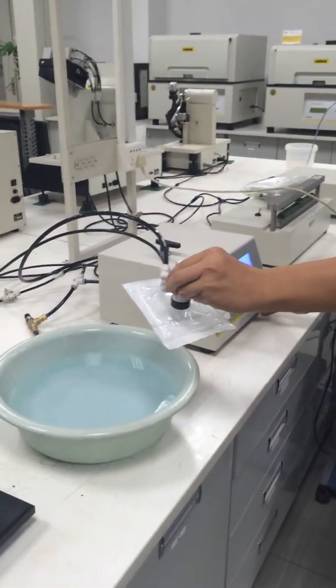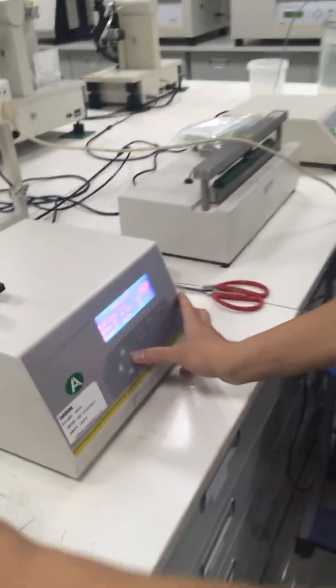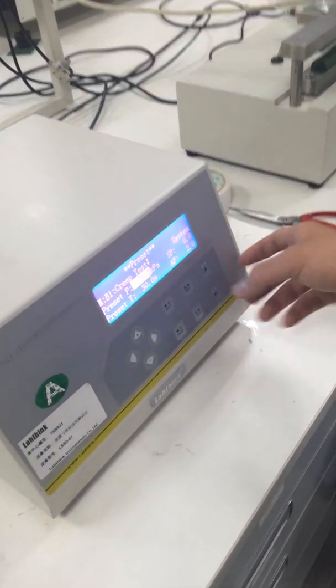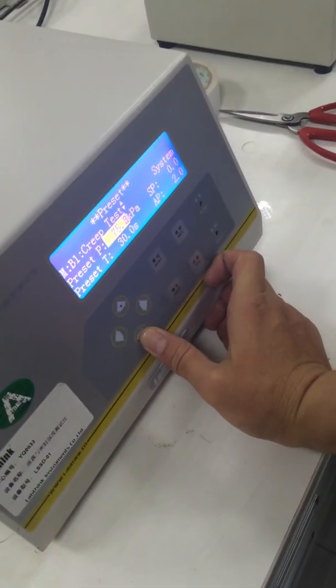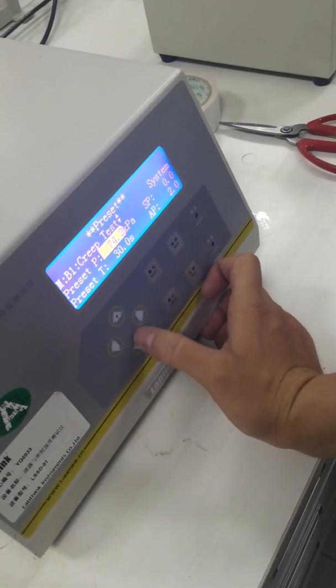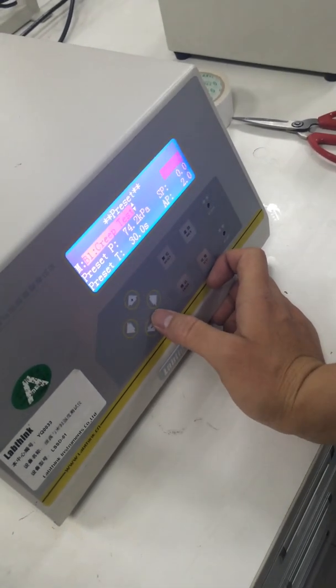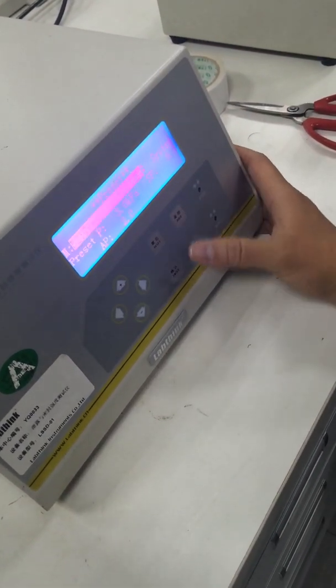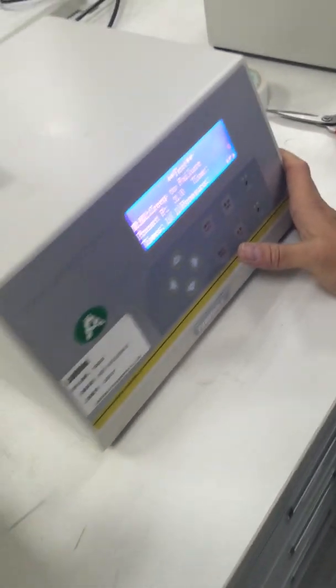I go to preset, and because I don't have the test mode you have, I'm using creep test or creep to failure test to simulate it. I choose this test mode and open the test.